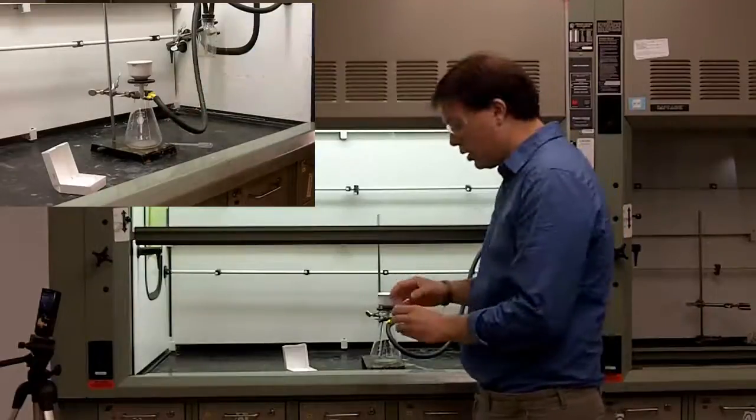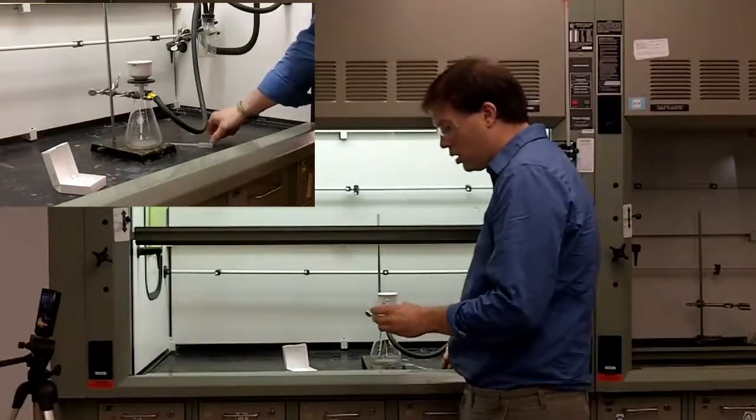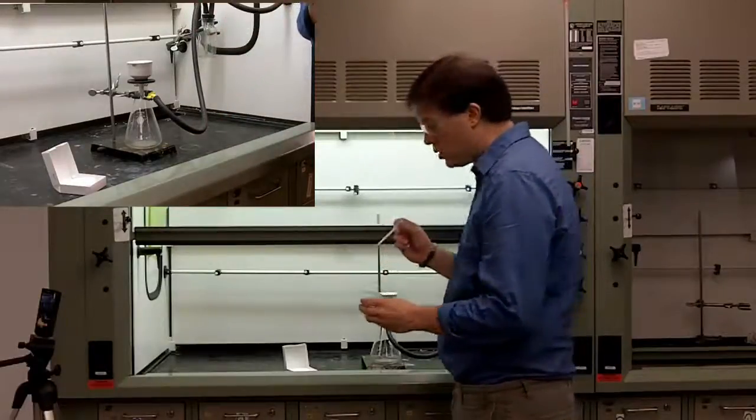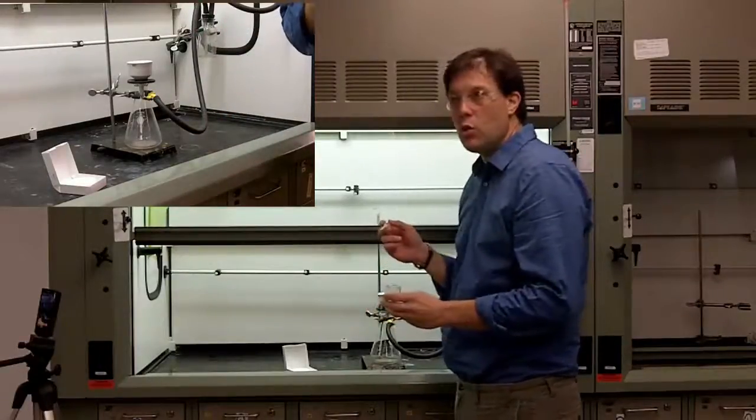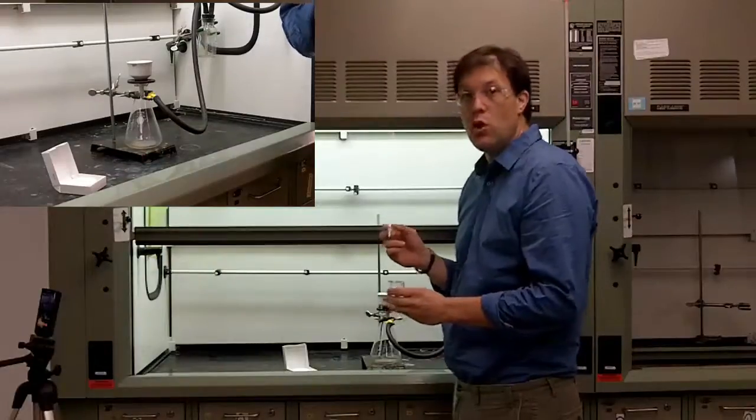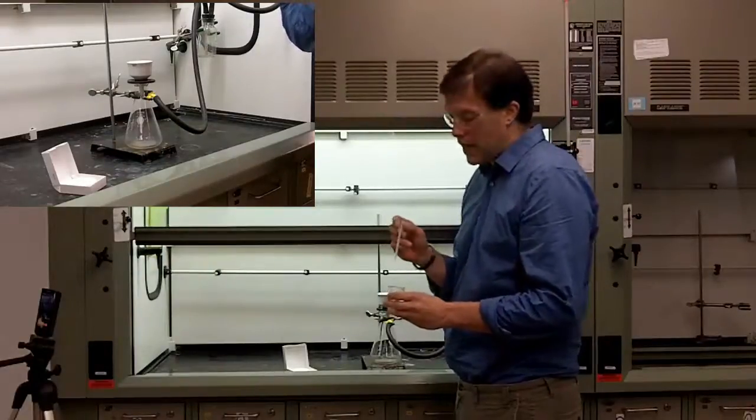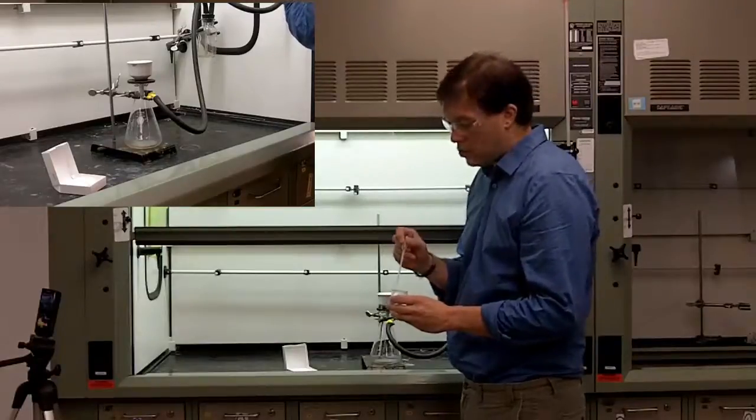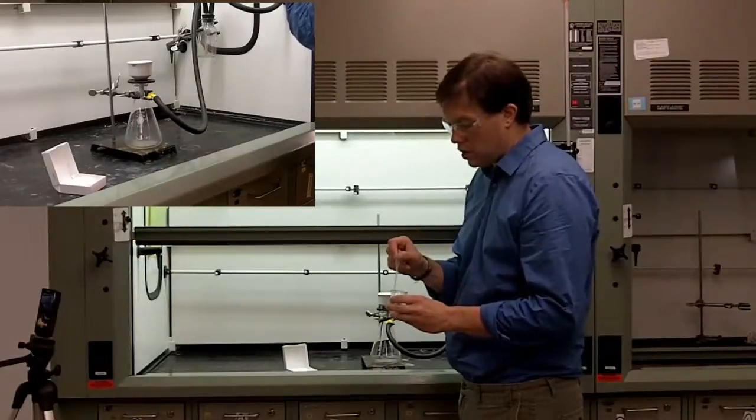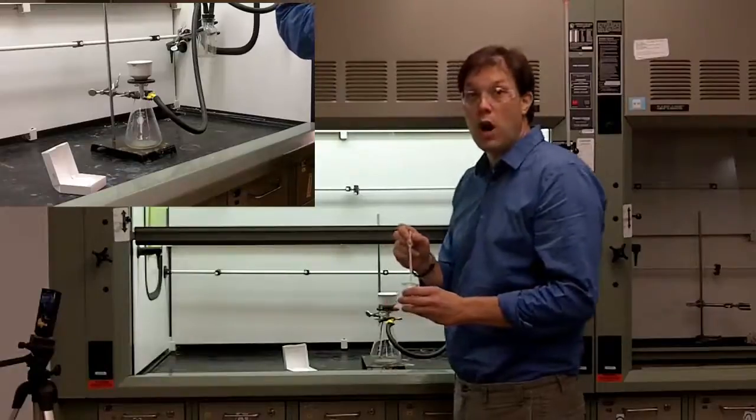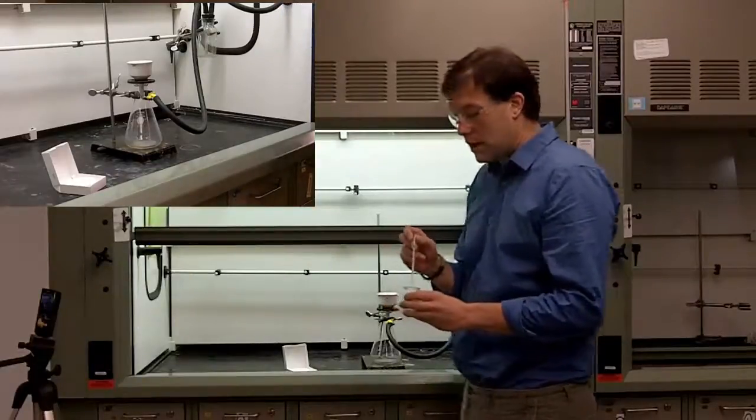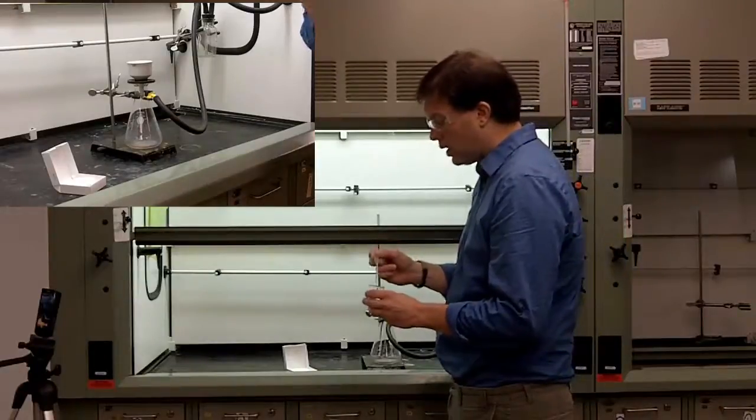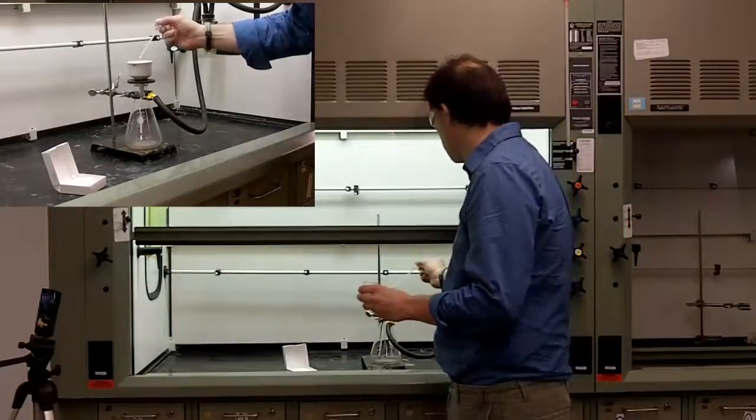So the last thing to do before pouring our sample onto the suction filtration is wetting the paper if you choose to do that. Now if you choose to wet the paper, make sure you only use the solvent that you are filtering your product out of. Anything else, and you may run into solubility issues. Many students just try and use water all of the time, but if your product is soluble in water, it will actually dissolve it because it doesn't all get sucked away before you put your sample in.